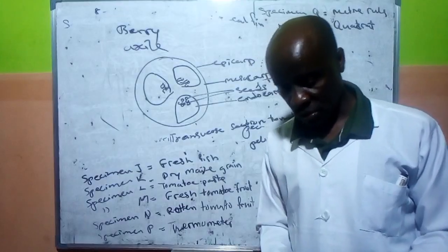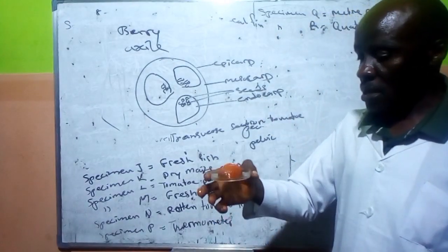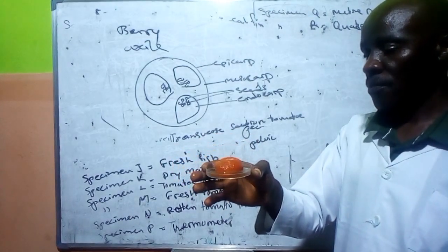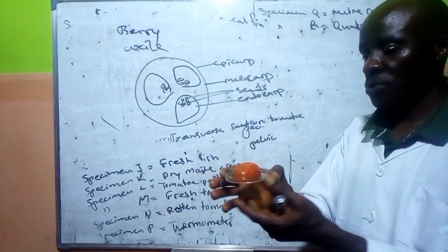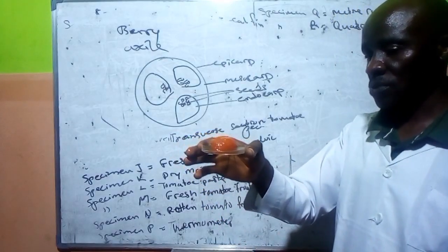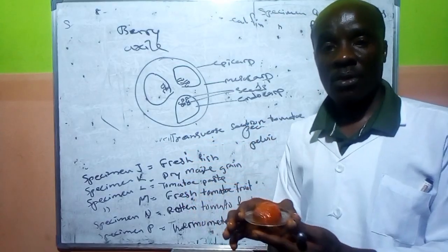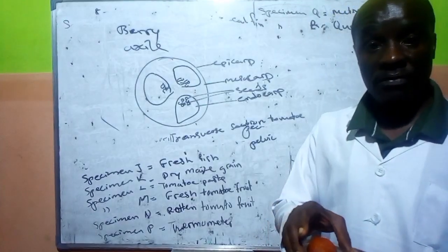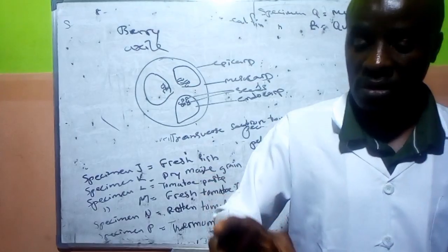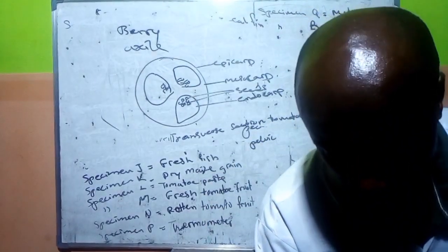Actually, the thing has shrunk to some extent. It's coming down somehow, and the fluid inside is also coming out, making this water change to some extent. It's changing the color of this water because the osmotic pressure outside is stronger than the one inside now, making the water come out of this very tomato. And see how stiff the thing is at this moment. So this is one of the things that we can also expect there.